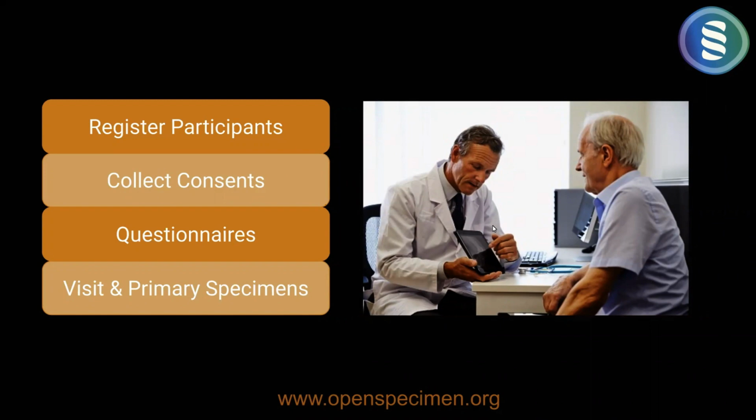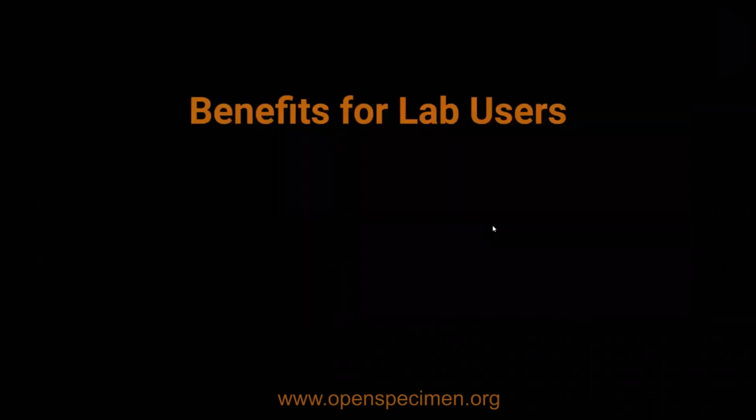And the other task is usually to collect the primary specimens of the patient. So for example, you collected the whole blood, tissues, etc., and all this is defined in the collection protocol. So you'll be able to see in the mobile app what the primary specimens configured in the protocol are, and whether you got them or not. You check, add additional details and submit. So these kinds of things you can do with the mobile app.